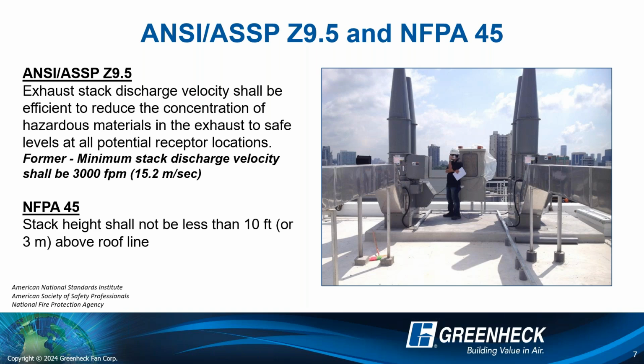It's a common question we get a lot. Can you make your fans 9.5 feet tall, 9 feet tall, whatever it may be? The answer is always going to be no. So those are the two standards: ANSI Z9.5, 3,000 feet per minute, and then NFPA 45 at 10 feet tall systems.